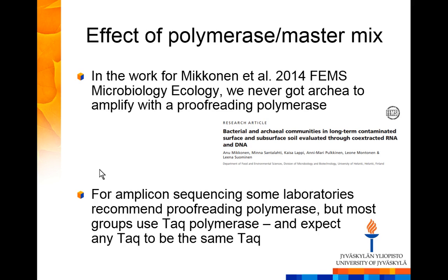And of course, when later cloning and sequencing our archaeal amplicons, we were a little bit wondering, what will we get? Is it archaea at all? But it was all archaea. It was just that the other polymerase didn't work. So these are the kind of things you may see. Taq polymerases may work better. And actually, a lot of people use Taq polymerase.